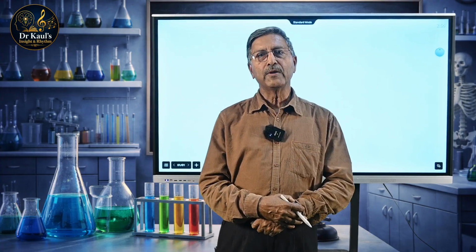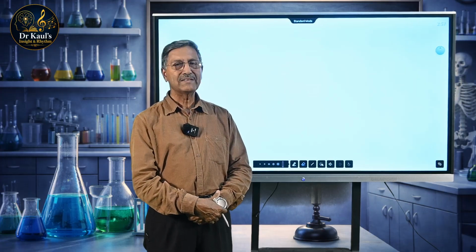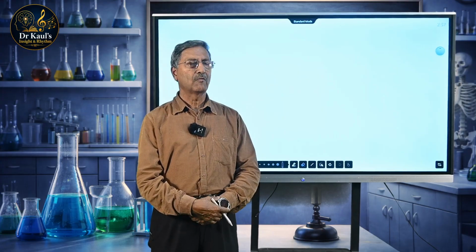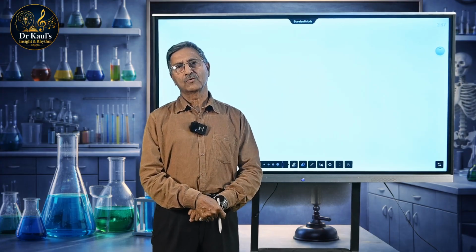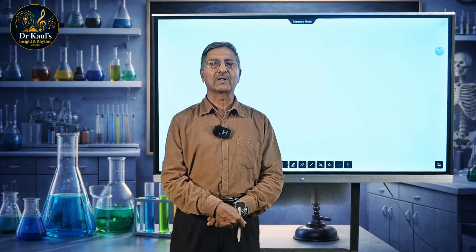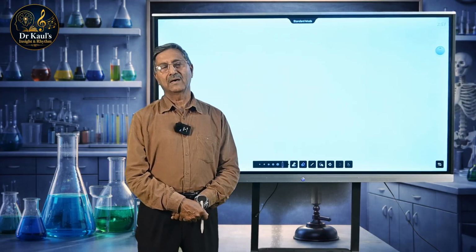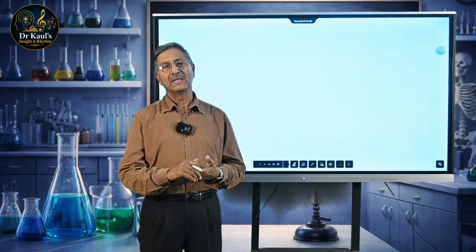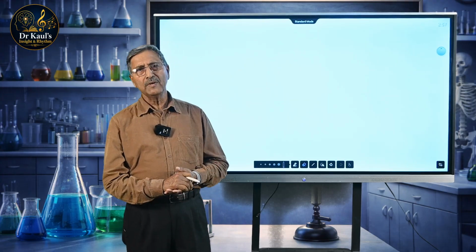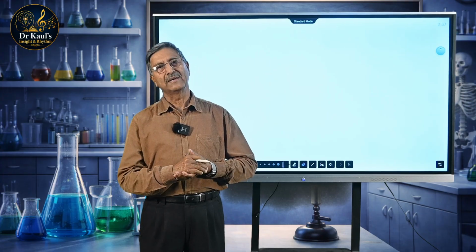Again, I would like to remind you that these confirmatory tests are known as wet tests. For performing wet tests, we have to have the solution of the acid radical, and we have already discussed that we take three types of solutions. If the salt mixture is water soluble, it is a water solution. If a portion of it is soluble in water, then it is treated as water extract, and if some portion of the salt mixture is insoluble, then we prepare sodium carbonate extract or soda extract. We will make use of these solutions as and when applicable.